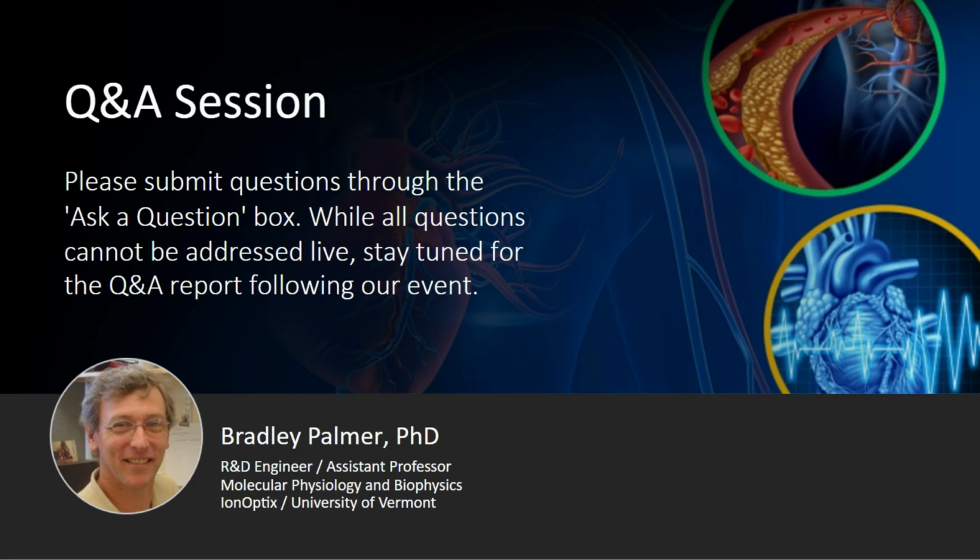Can these sections be stained with fluorescent antibodies? Yes, absolutely. The slices, if I understand it correctly, would have to be lysed in such a way that you can get the antibodies into the cells. But it depends on what kind of antibody you're using and what it is you're actually trying to image. But they're very useful for imaging, even with antibodies. Yeah. Great.